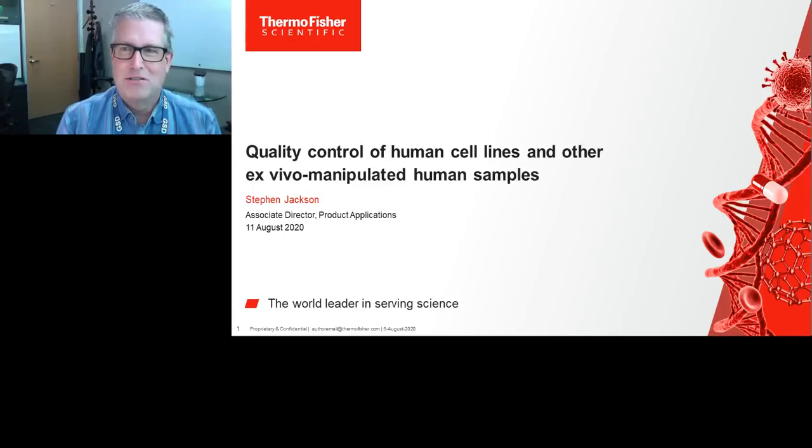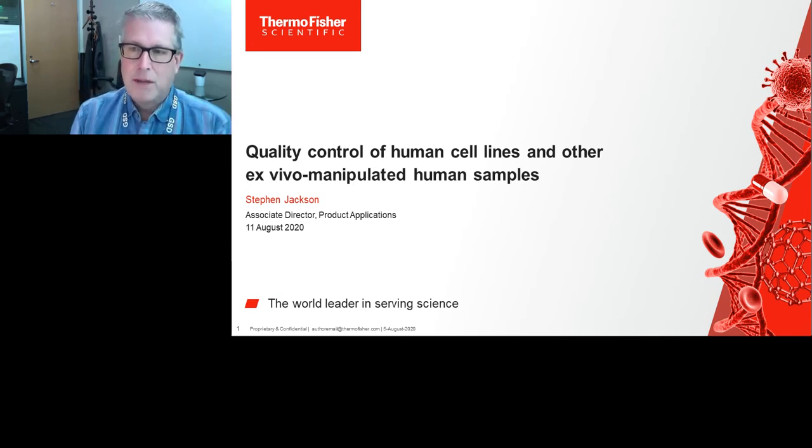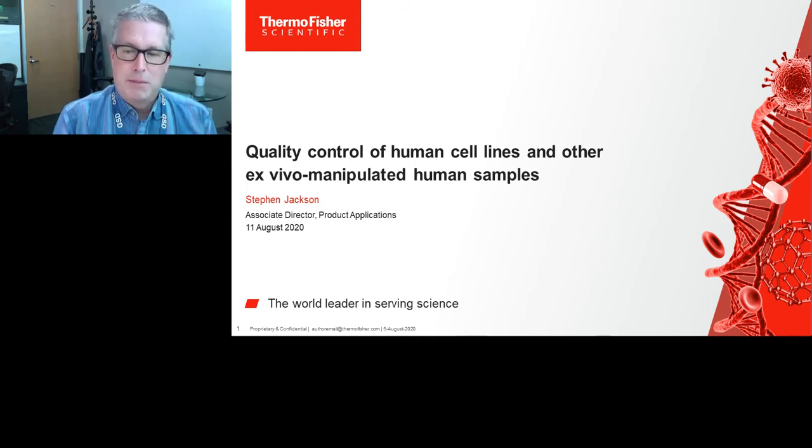I'm the Associate Director of Applications Development at Thermo Fisher Scientific in the Genetic Sciences Division. In today's talk, I'm going to tell you a little bit about how you can analyze cells that you've taken out of human subjects and manipulate them in vitro. This is important because you want to make sure the cells that you're working with are the same as the cells that you think you're dealing with, and mistakes are not made in terms of identity of those cells.